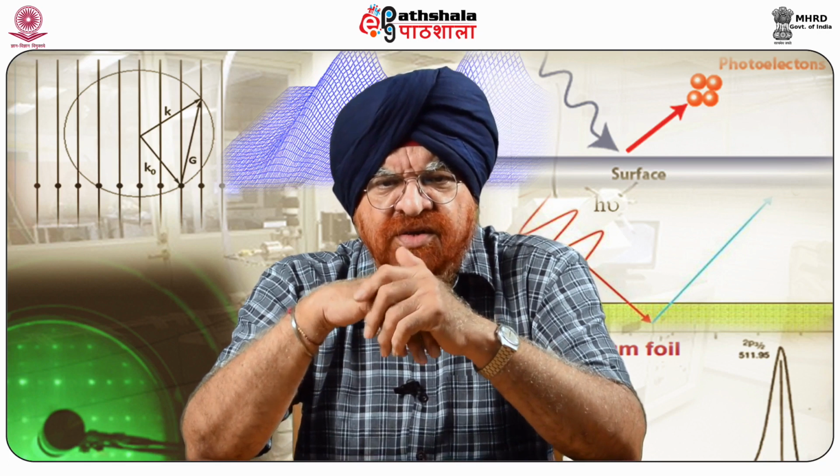We have given the examples of methyl, NH2 or COOH, and more exotic biological molecules have been studied too. The tip is scanned over a sample to detect differences between the species on the tip and those on the surface of the sample. Chemical imaging of structures present on the surface, due to differences in interactions between the tip and the sample, can be studied.